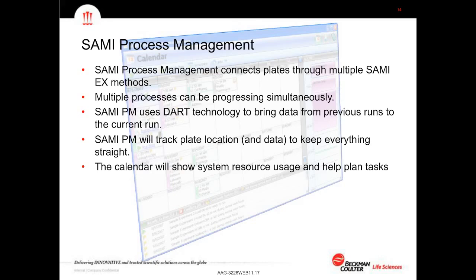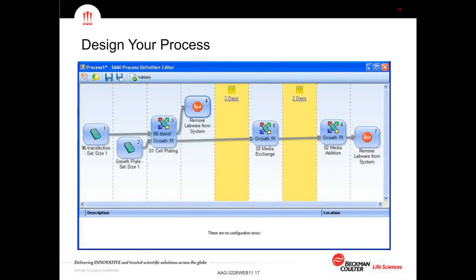This is just a snapshot view of how you would design your process. And if I can just draw on here, these elements are our SAMI methods, our daily tasks. These parts at the very beginning are labware entering the system, and then you can see they're separated by those 2-day incubations. So we can see here very simply how we're building out a process linking together those SAMI tasks.